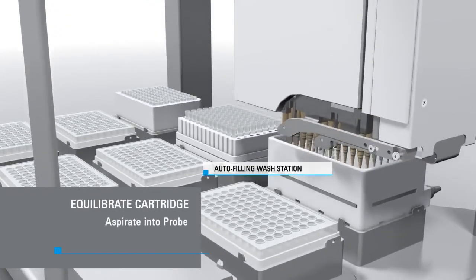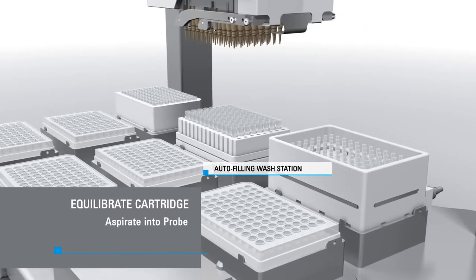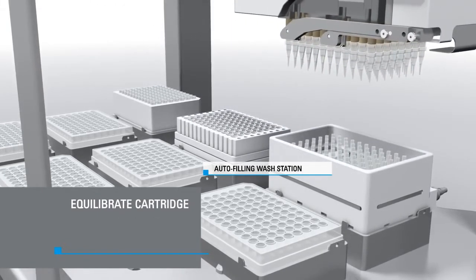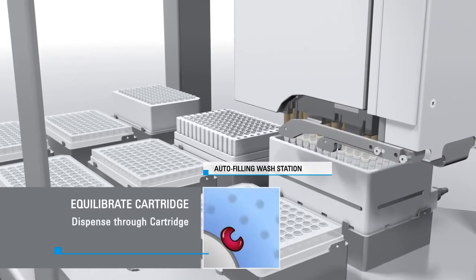First, the cartridges are equilibrated by aspirating buffer from the wash station into the syringe probes. The AssayMap protein A cartridges are mounted on the probe and the buffer is dispensed into the cartridge.